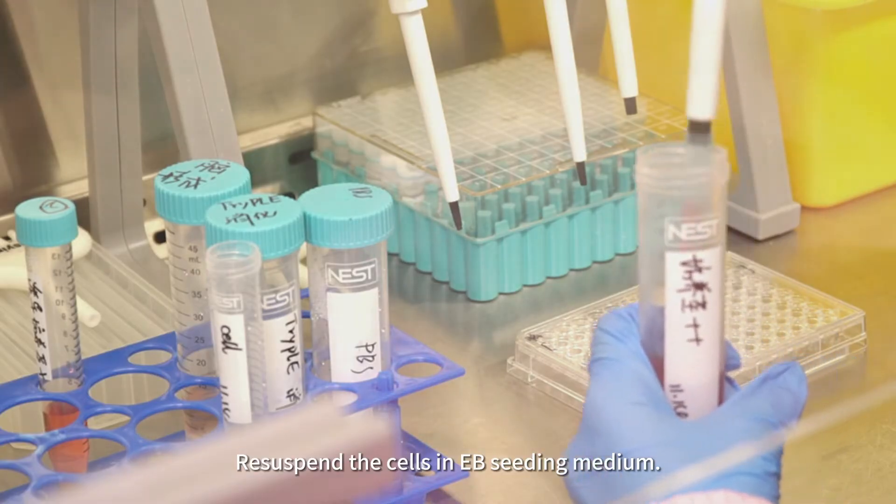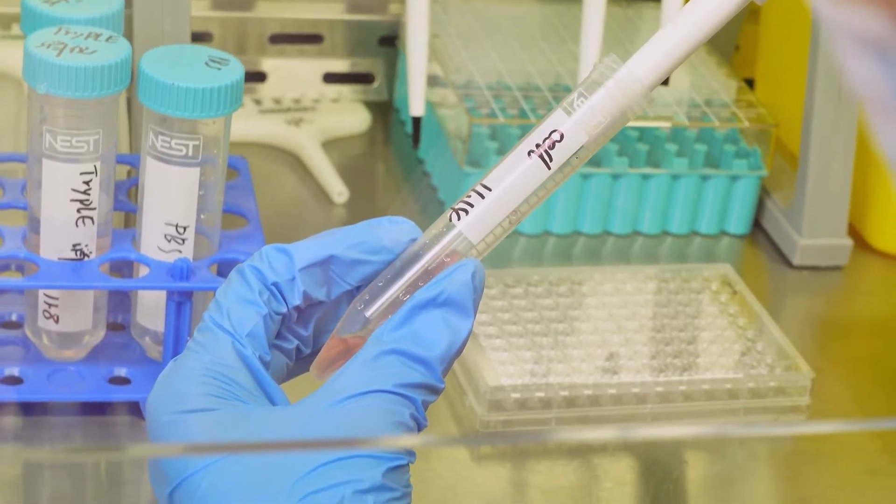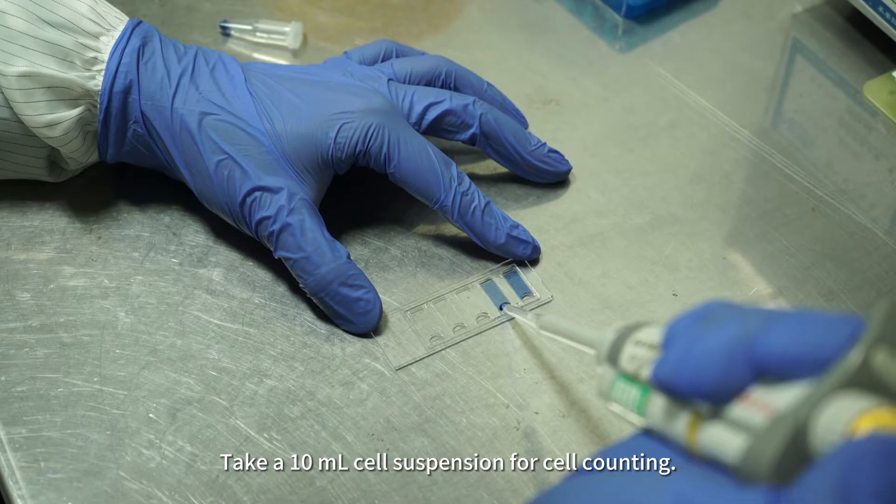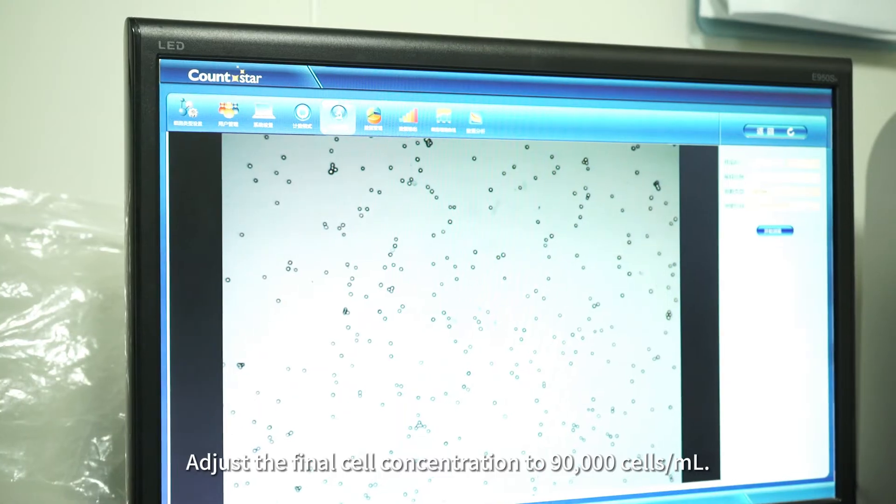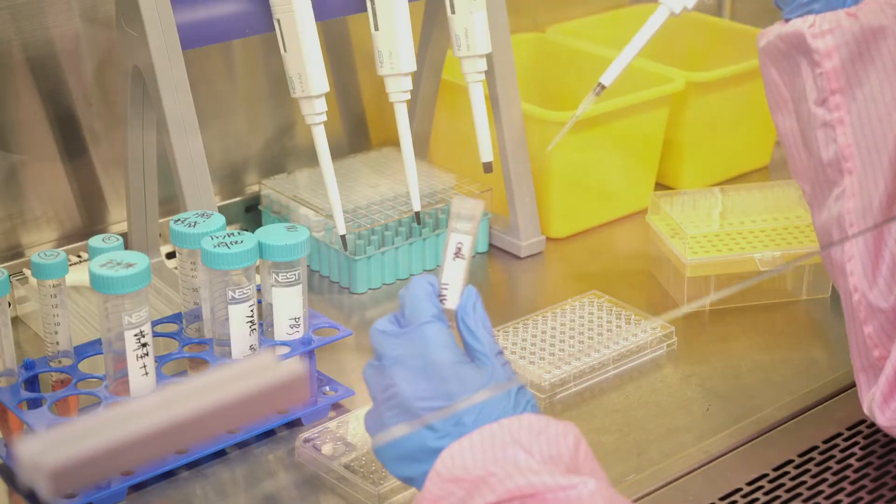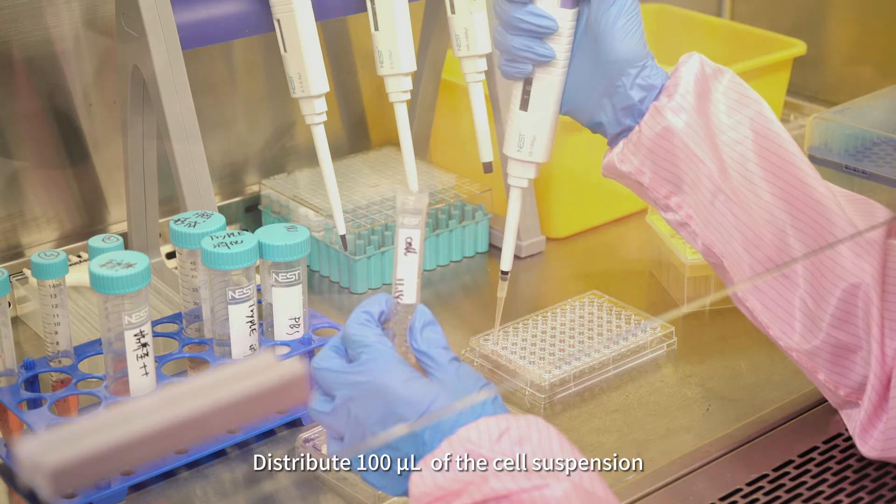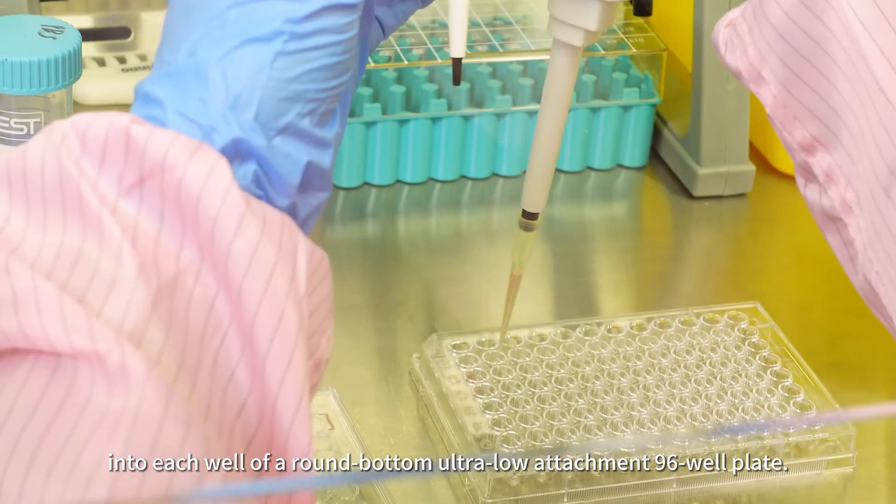Resuspend the cells in EB seeding medium. Take a 10-microliter cell suspension for cell counting. Adjust the final cell concentration to 90,000 cells per milliliter. Distribute 100 microliters of the cell suspension into each well of a round-bottom ultra-low attachment 96-well plate.